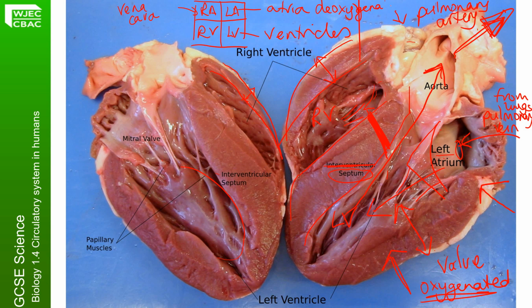And this deoxygenated blood has very little oxygen. It's going to be pumped off to the lungs by the pulmonary artery to go and pick up some more oxygen, ready to do another circuit. So if we have some of this deoxygenated blood trickling through into this side, it means that this blood that's going to go off to the head and body has got a little less oxygen than it should have.